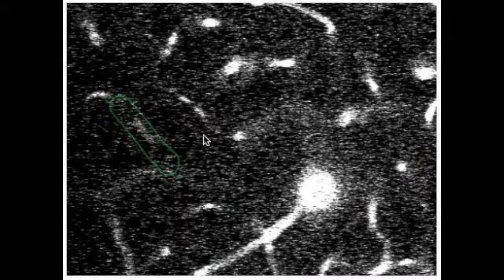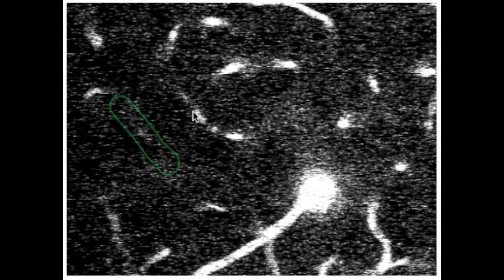Interestingly, if you look at this adjacent vessel here, there are some black spots — this one, and this one, and possibly here. As we move the slider back and forth, those black spots actually look like they're stuck. So even though we're annotating this vessel which is flowing, it's interesting to notice that this other vessel right next door actually appears to be stalled. This is a nice example of what a stall might look like in a very grainy movie. We'll answer flowing, because it's the vessel in this outline that we're answering.